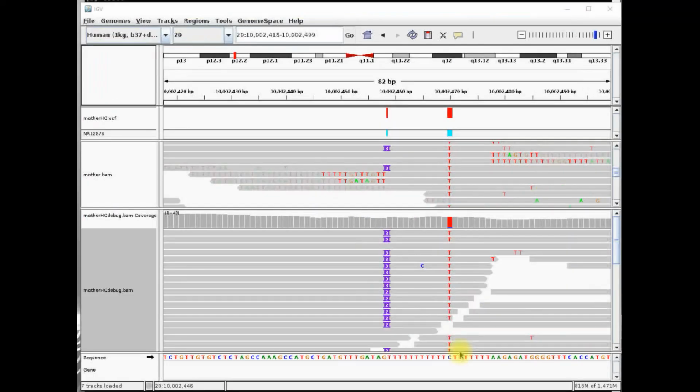The haplotype caller calls both SNP and indel simultaneously via local de novo assembly of haplotypes in an active region. Essentially, when this variant caller finds a region with signs of variation, it tosses out the old alignment information from, for example, BWA-MEM, and performs a local realignment of reads in that particular region.